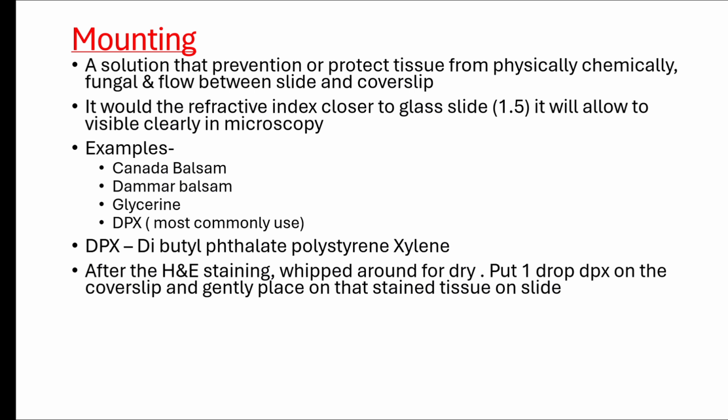Then mounting. Mounting medium is a solution that protects the tissue physically, chemically, and from fungal growth, and holds the flow between slide and cover slip. It has a refractive index close to the glass slide, that means 1.5. It allows the tissue to be seen clearly in the microscope. Examples are Canada balsam, Damar balsam, glycerin, DPX. The most commonly used mounting medium is DPX. Full form is dibutyl phthalate polystyrene xylene.